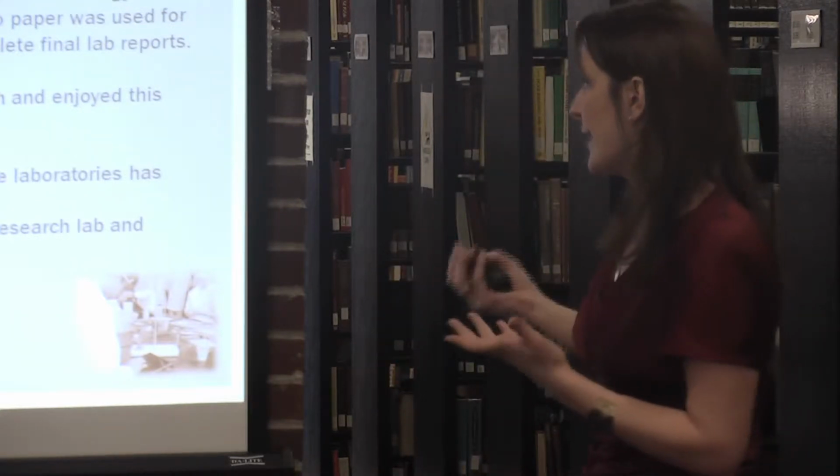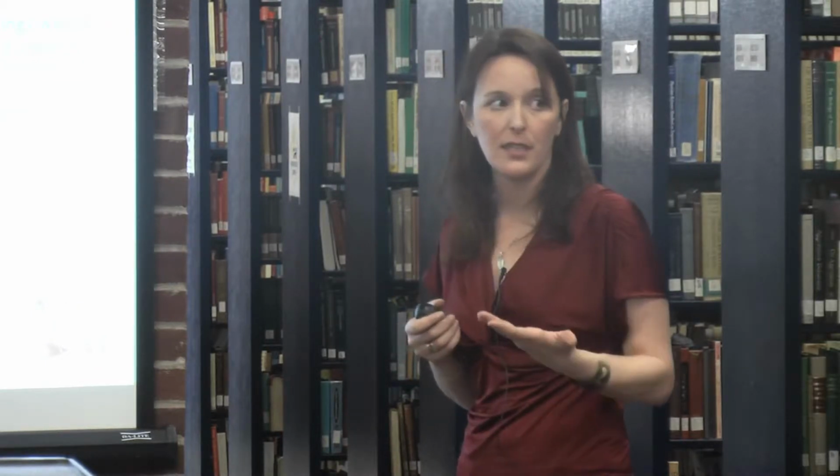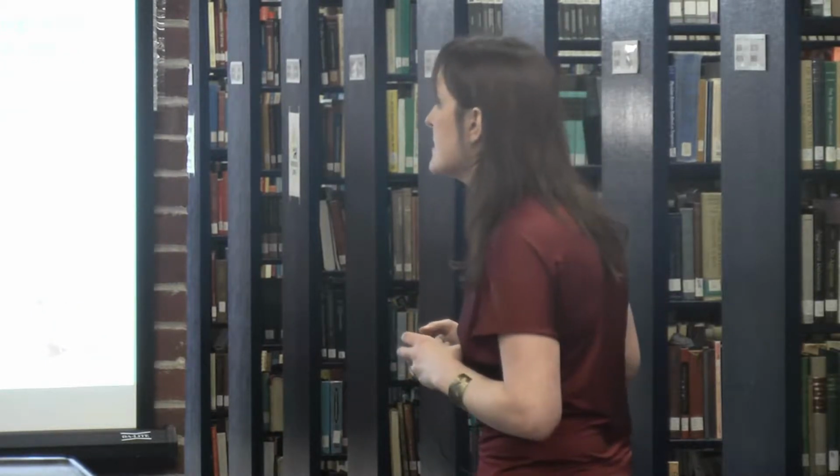To date, when we started looking at research on this and I started figuring out how I was going to make this work, I really couldn't find a lot of undergraduate experiences of iPads making it into the laboratory. So we're one of the first groups who've used it as an electronic notebook in this type of way. It is being introduced, though, and it has been used in industry and commercial types of settings.